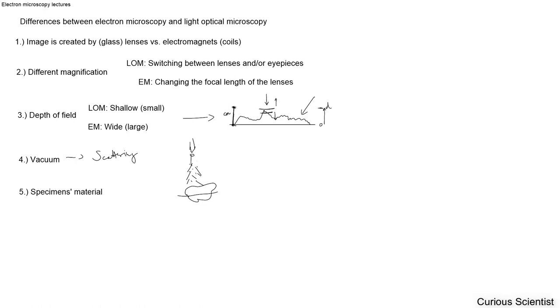And of course, for a light optical microscope you don't need vacuum, and the need for vacuum will also limit the specimens that you can put in your microscope, and also the materials, but that's more like the fifth point which I wrote here.